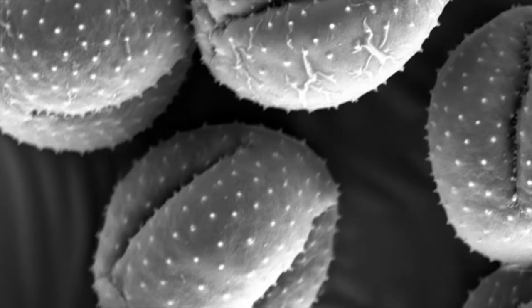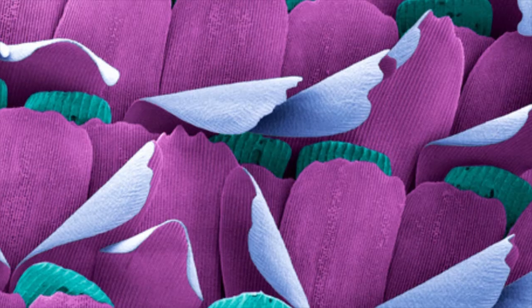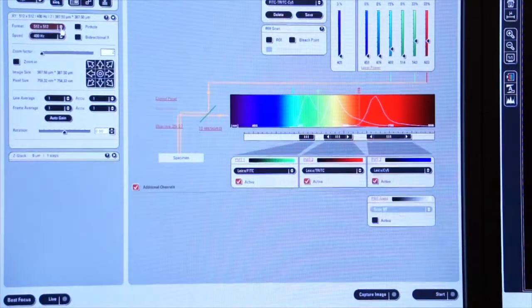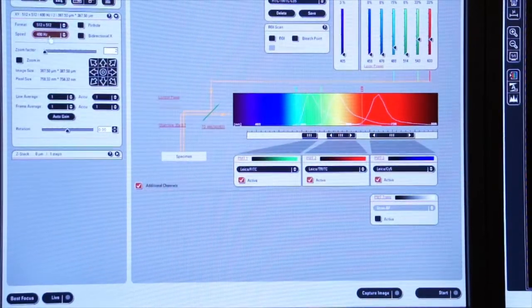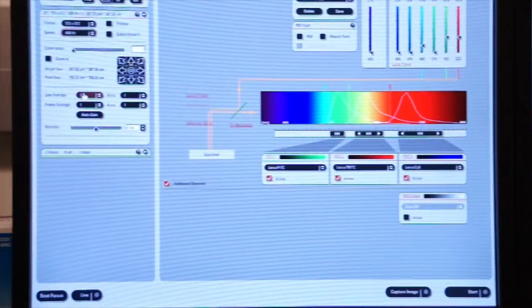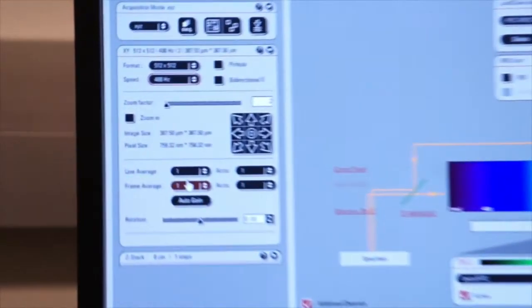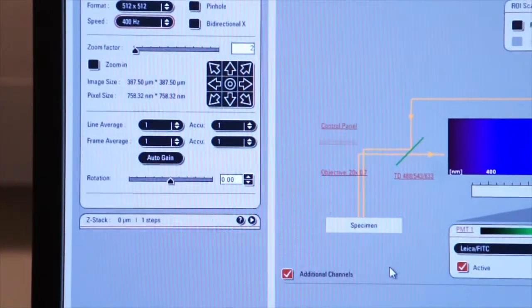Let's discuss improving the quality of our image and trying to get the highest resolution, least noisy image possible. We'll begin with 512 by 512 as you see here on our resolution. Our speed is at 400 hertz and we have not engaged any line or frame averaging.